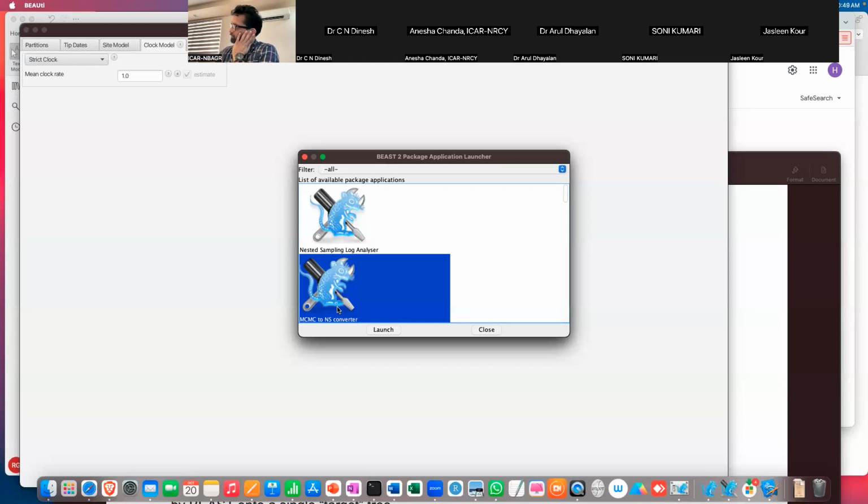The PPRD file which you send us, that is the FASTA file. You have to convert that file into an alignment file from jModelTest. Then we put this into BEAUti. You can convert it using any other software. I gave you jModelTest 2 because I consider it to be one of the best. Even in MEGA, you can pull that out and save it in FASTA format.